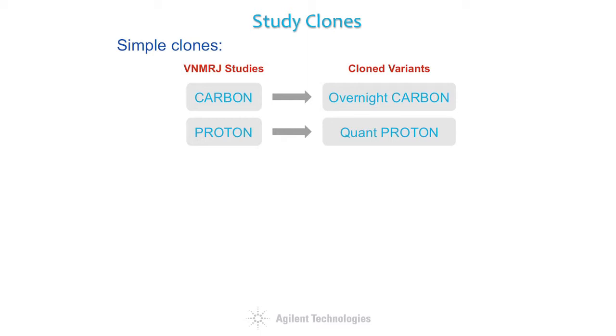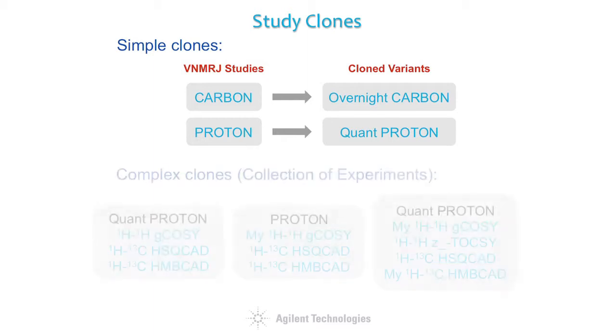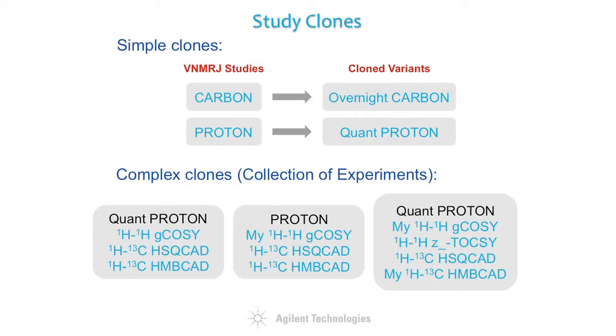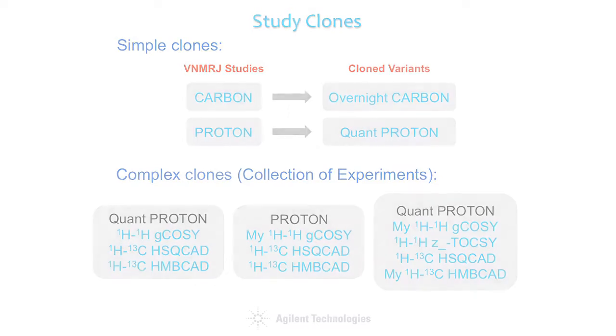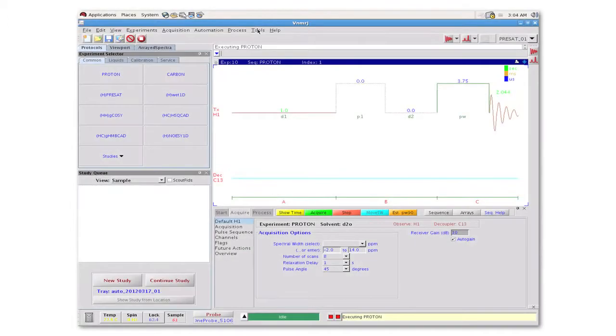Study clones can be very simple such as a carbon experiment that is reconfigured to run overnight or a proton experiment that has been parameterized to collect data for quantitative analysis. Alternatively a study clone can encompass a collection of experiments that are each customized for a specific task or class of compounds. Let's look at a few examples of how a study clone can be used to make the user's life easier and more efficient.